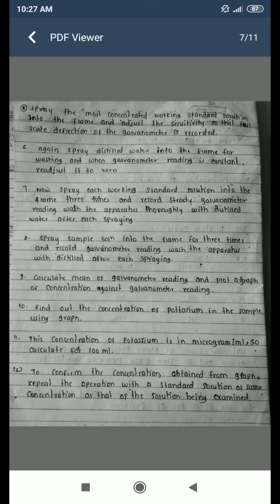Now spray each working standard solution into the flame three times and record the steady galvanometer reading. Wash the apparatus thoroughly with distilled water after each spraying. Spray the sample solution into the flame three times and record the galvanometer reading. Wash the apparatus with distilled water after each spraying. Calculate the mean of galvanometer readings and plot a graph of concentration against the galvanometer reading to find the concentration of potassium in the sample.